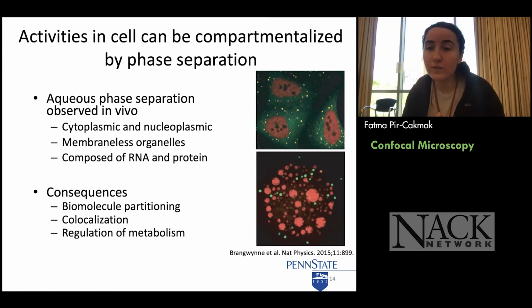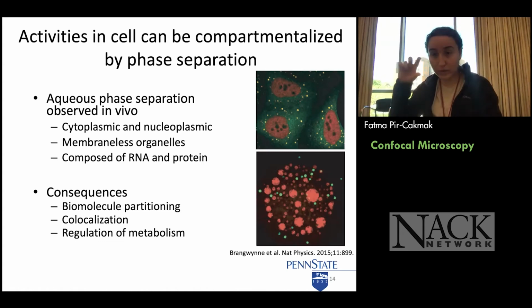And what I was doing was creating these compartments in vitro. In vivo, people are actually observing this phenomenon, and it's very interesting, and it has been indicated in many diseases and cellular functions. So I was able to recreate this in vitro, meaning in the test tube, not in the cell.